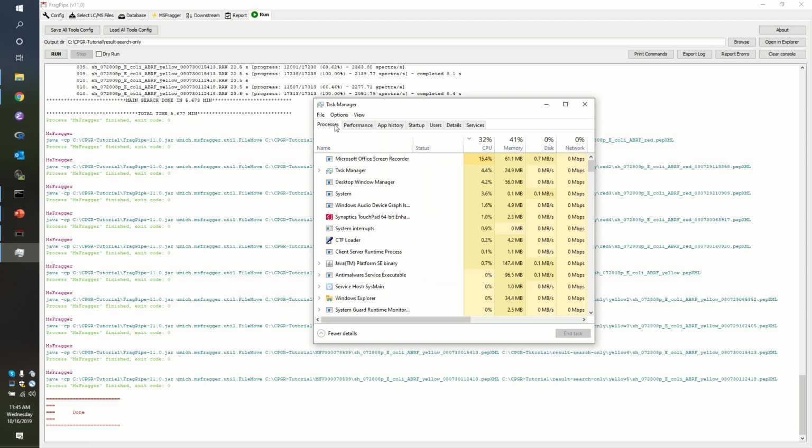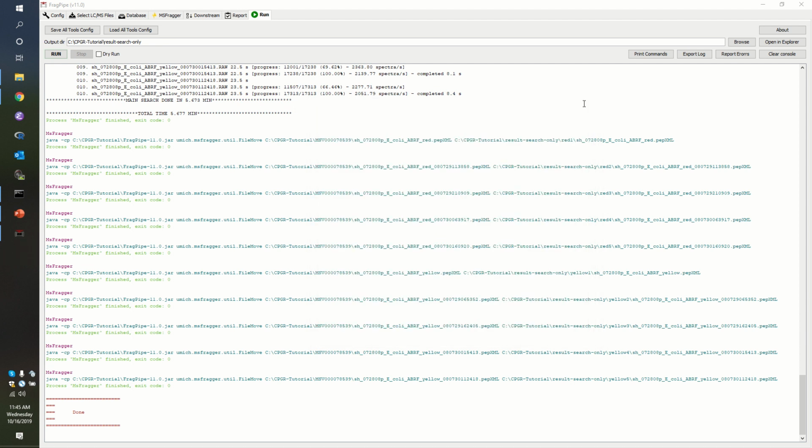I would point out that in this case, MSFragger is not working from mzML files, and that means it needs to read raw files. But it doesn't know the format of raw files. It is only able to access that through a library made available by Thermo. And that library is called BatMass. So in effect, MSFragger is saying, hey, BatMass, can you help me with this raw file? I don't speak raw file, but you do. You translate this to spectra for me. So BatMass does this translation from raw to a data structure that MSFragger can read, and then MSFragger does the analysis.